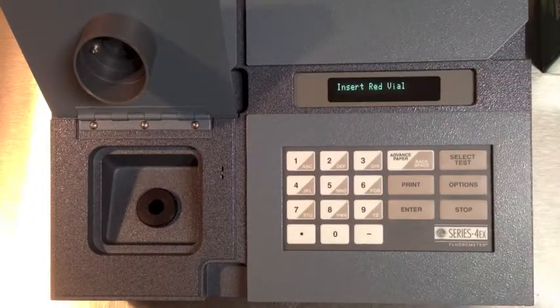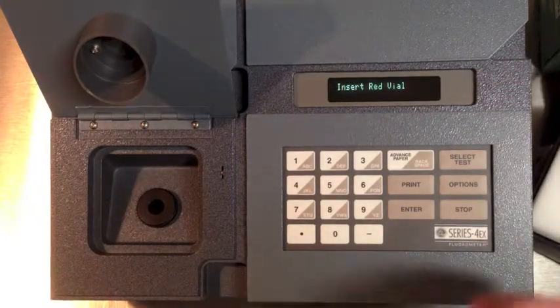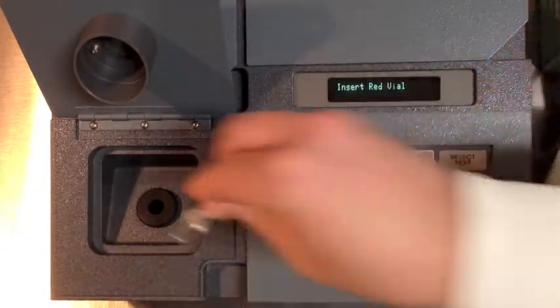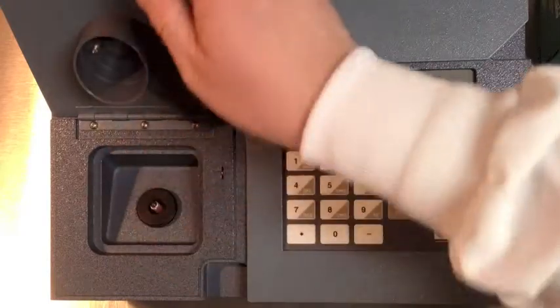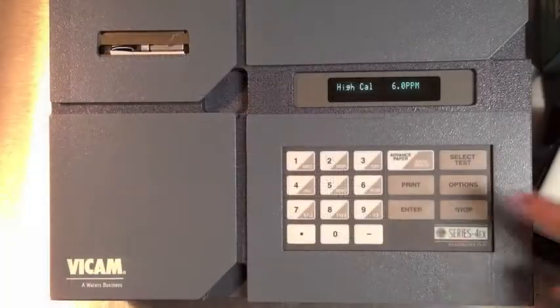The screen will prompt you to insert the red vial. Use a Kimwipe on anything that goes into the fluorometer. Use the calibration setting from the current procedures manual, then press Enter.